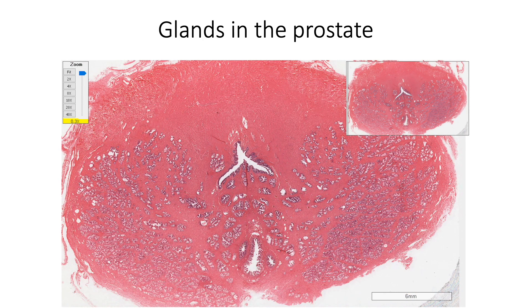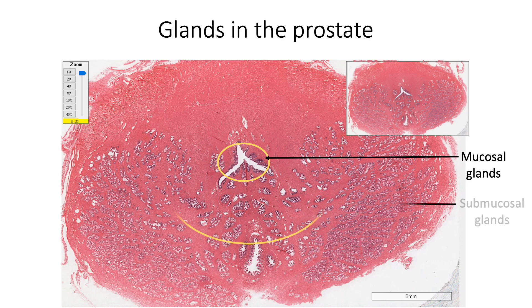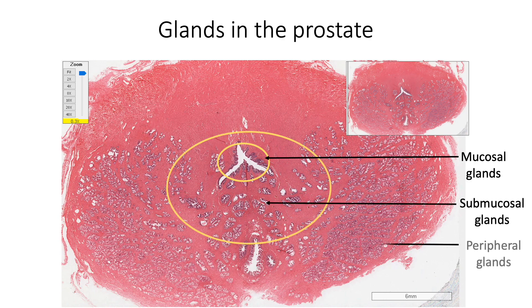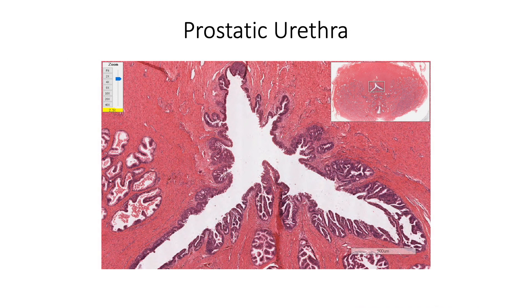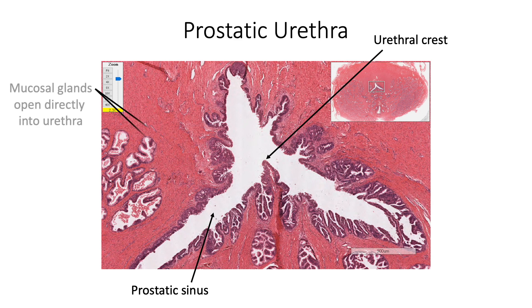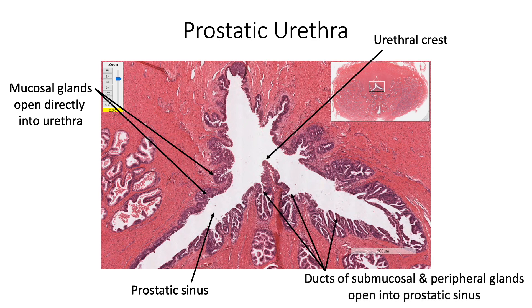Based on their location and termination, prostatic glands are described as arranged in three concentric layers. The innermost circle of mucosal glands opens directly into the urethra. The middle layer of submucosal glands and the outer layer of peripheral glands open into the urethra through their ducts, specifically into the prostatic sinuses on either side of the urethral crest. Here we are seeing a section of the prostatic urethra showing the urethral crest in the posterior midline and prostatic sinuses on either side, with the inner mucosal glands opening directly into the urethra and the ducts of submucosal and peripheral glands opening into the prostatic sinuses.